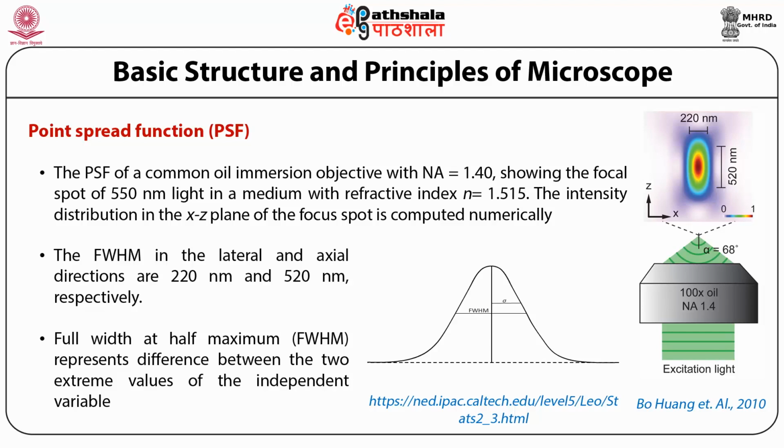resolution is 520. That means the diffraction pattern for a single point viewed under a microscope will represent a big dot of 220 nanometer in x and y and 520 nanometer in x and z. That is the vertical resolution.